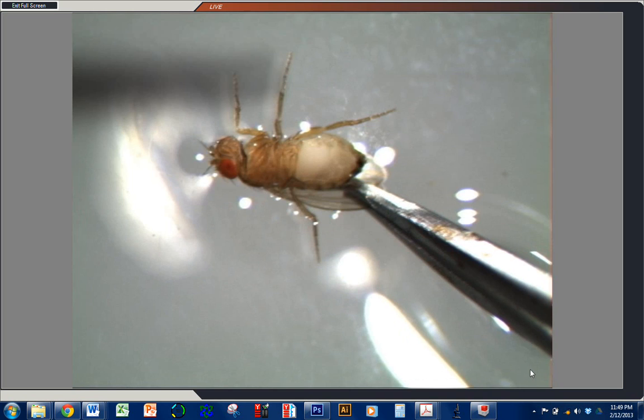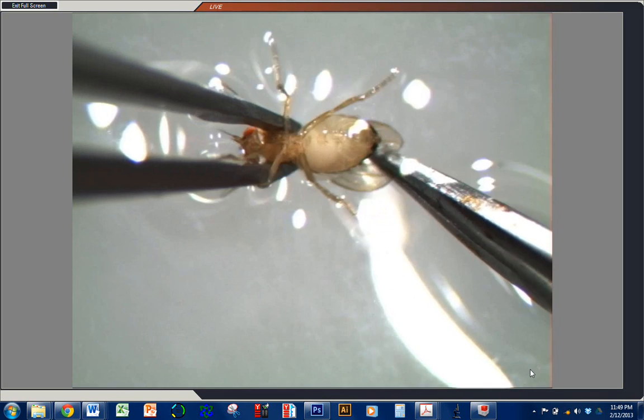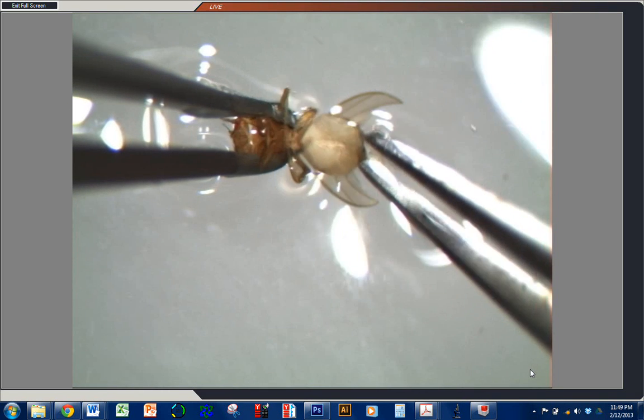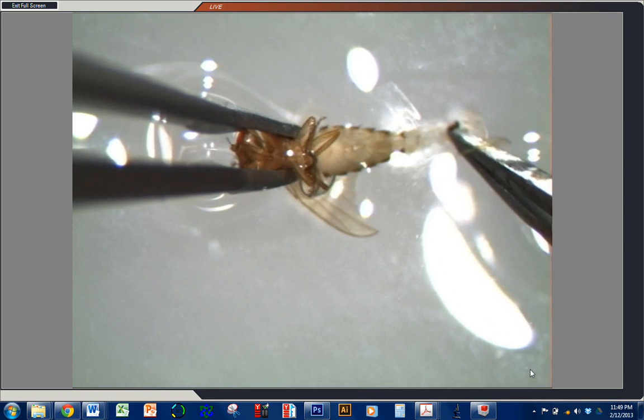We're going to take two tweezers, one of which is a little duller than the other. The dull ones you hold in your non-dominant hand at the thorax; your sharper ones you grab at the tip of the abdomen, and pull.